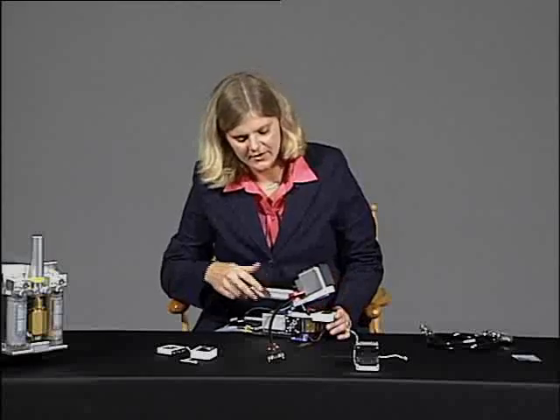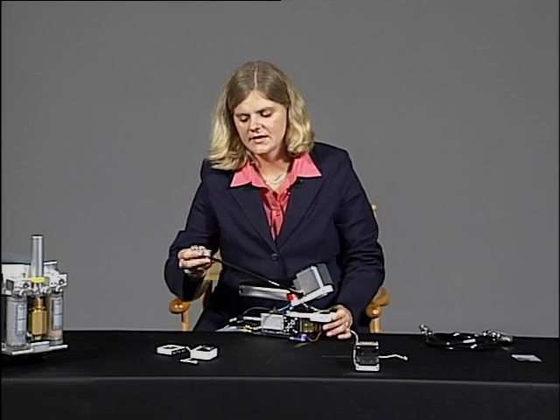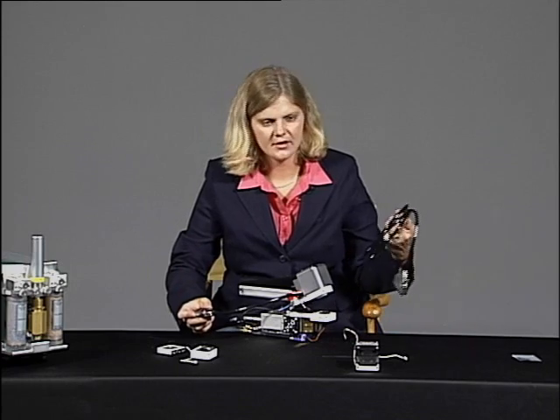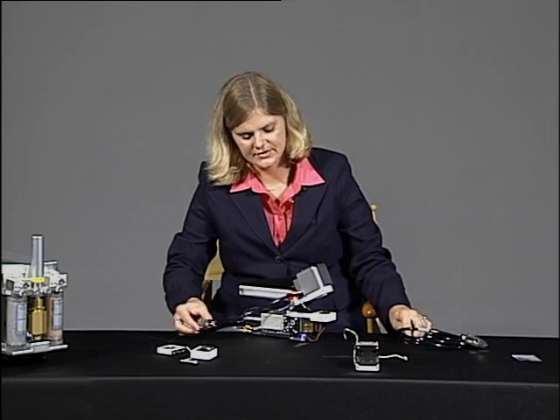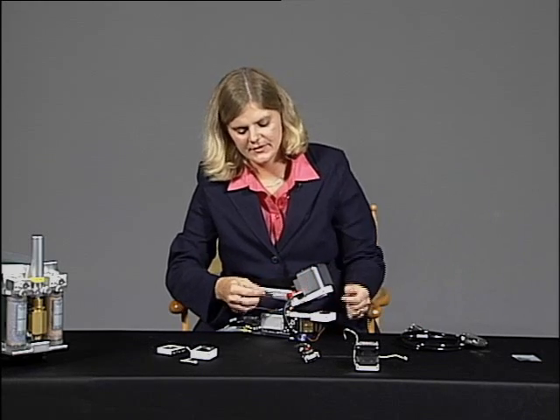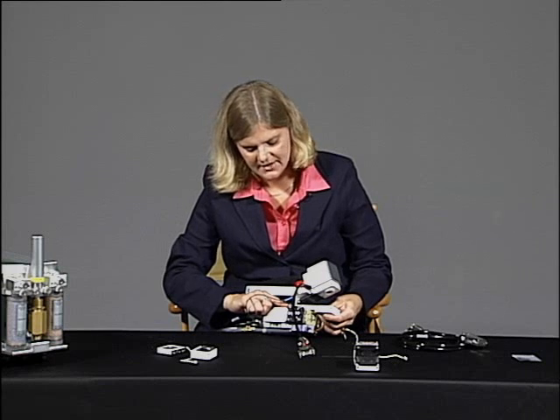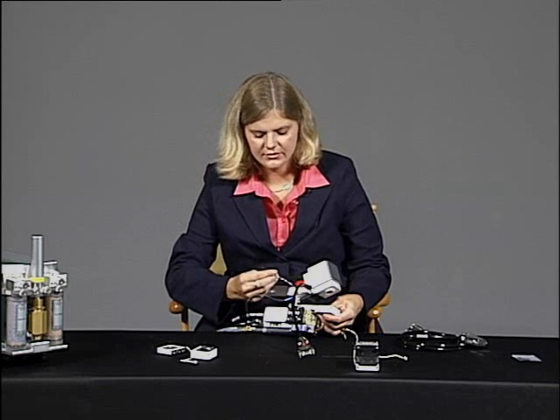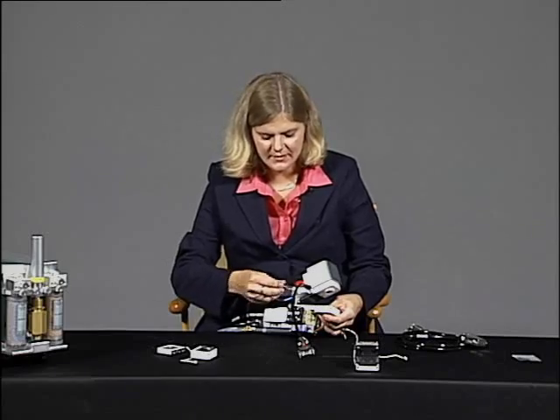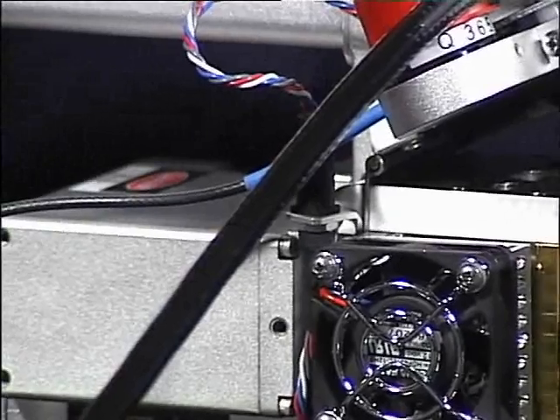You'll notice that there are two cables coming from the fluorometer. One of the cables leads to an additional cable that connects to your console, and we'll talk about that in just a minute. The smaller cable provides some power to the fluorometer, and that connects to the connector on the side of the sensor head, and you'll notice that there are notches in both connectors. So simply line up the notches and press it down to put it in place.